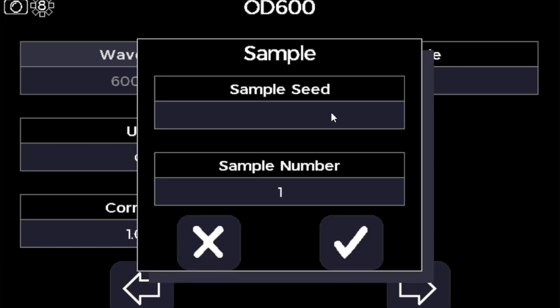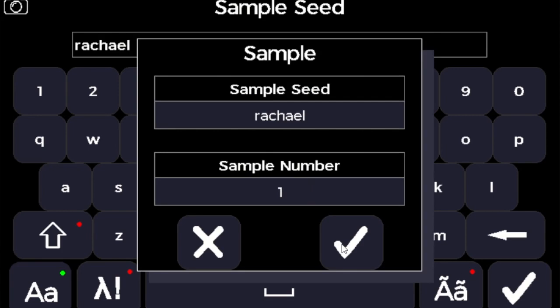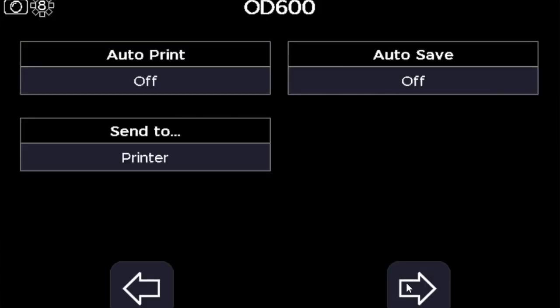It will then guide you through the application from naming your sample. There's a standard keyboard that you can use to give as many names as you want — I'm naming it after myself. It will also follow through and pick up sample numbers tied to that initial name, following numbering on sequentially.